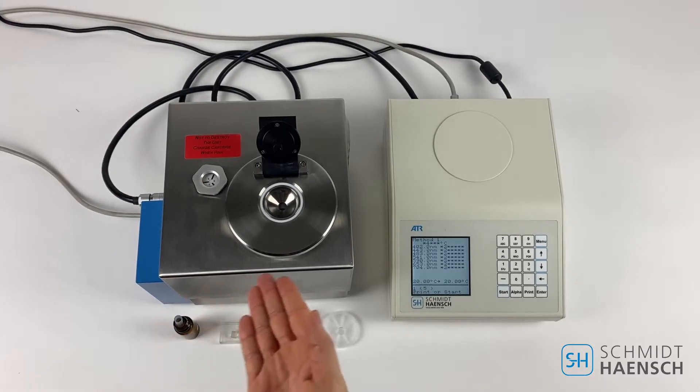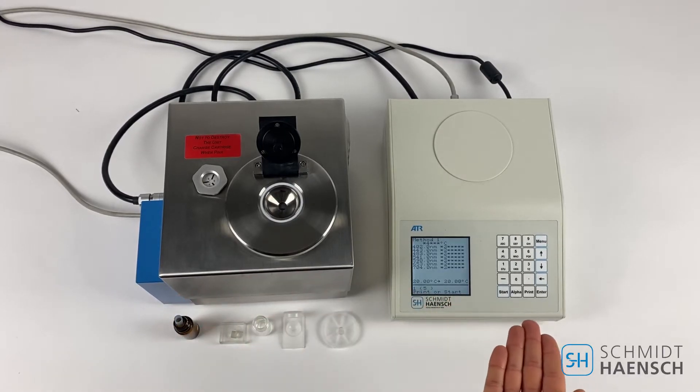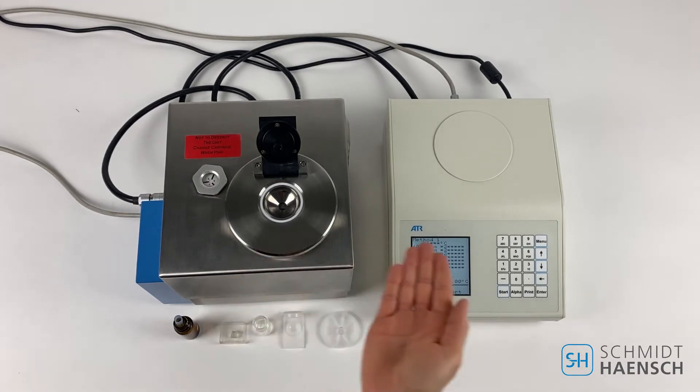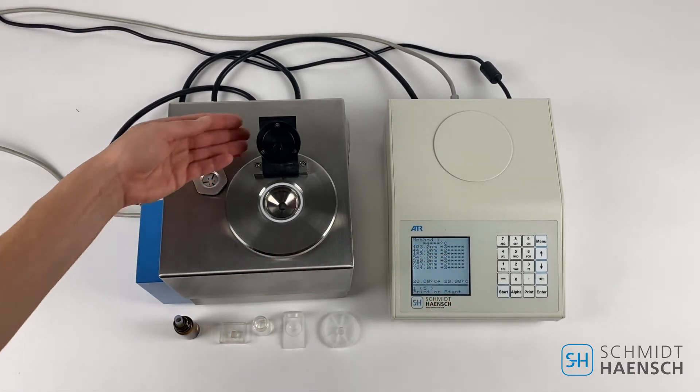This is ATR Lambda by Schmidt and Haensch. As you can see, this is our prism box and this is the display.